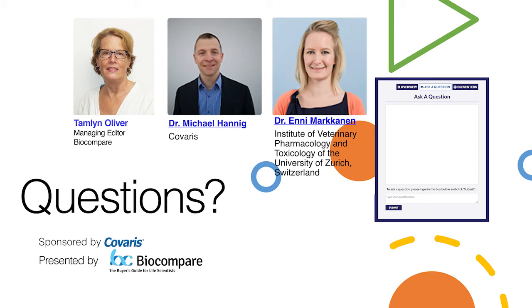The sample preparation, like the method of how to prepare the samples for laser capture microdissection, you mean? So what we do is we just cut, it's a routine pathology lab procedure. You take your formalin-fixed paraffin-embedded tissue samples and you cut 10 micron sections. You have to be very careful if you isolate RNA that everything you're using is absolutely clean. So you're using RNase-free water. You really have to use clean blades to cut the sections. Otherwise, you might contaminate the sections with RNases, which then, of course, does not help you in the downstream applications.